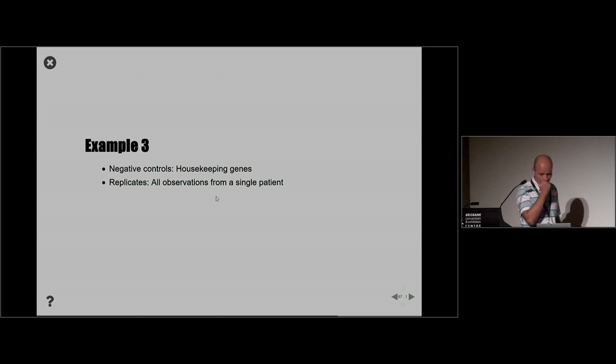So by treating all observations from a single patient as replicates, for patient 1, I've got as replicates the 9 different arrays from the 3 different tissue samples, but importantly I have different brain regions included in this set of what I'm calling replicates. Which means that I will end up adjusting away variation that is associated with brain region.